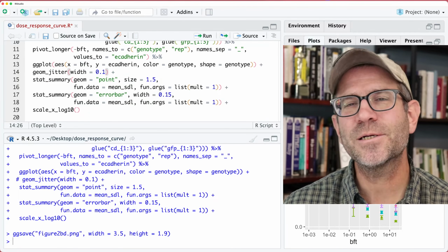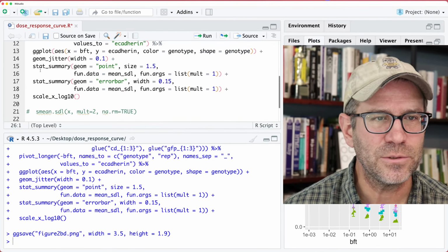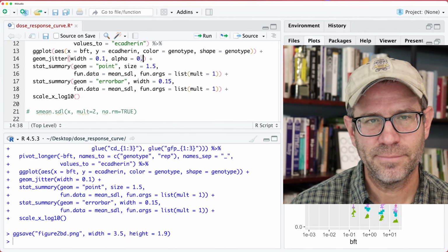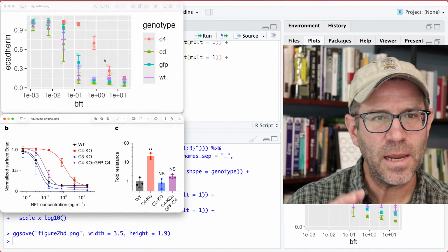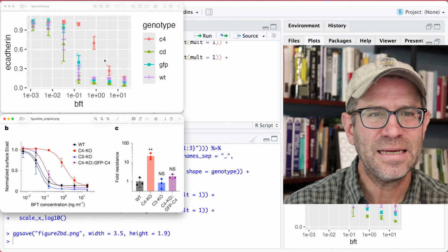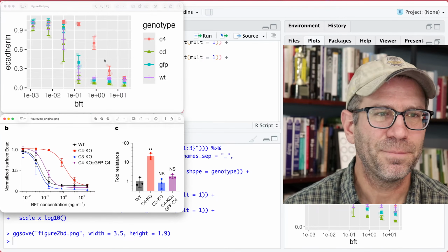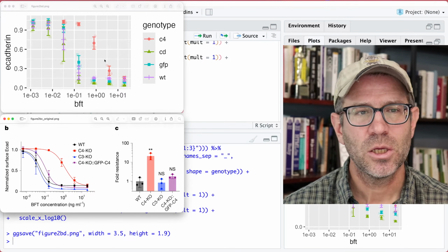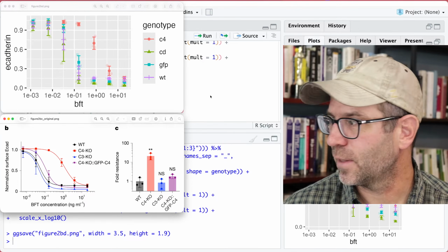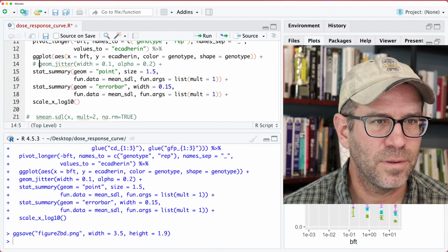data where we want to show the data, but if I do this, then it's a hot mess, right? And perhaps I could do something like geom_jitter. I could do alpha equals 0.2, right? To make the points fade into the background. Something maybe a little bit darker than that, but you get the idea. But it's just jumbled. It's just a mess, right? And so I kind of like the idea of them using that summarized data. So let's roll with that for now, and I think that'll be fine. All right, so I'm going to go ahead and get rid of that geom_jitter.